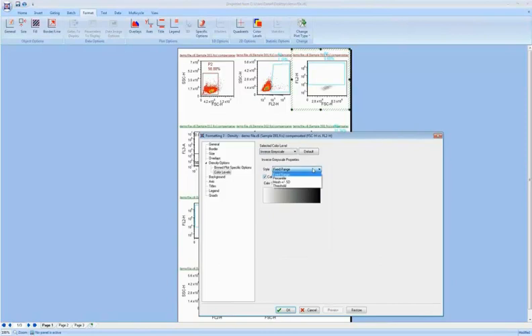This uses a fixed range. You can set up your ranges based on a mean plus or minus standard deviations, and so the appearance of your plot will change based on how you want to do that. So as you're preparing your plots for publication or for reporting, you have many options of how you want to look at it.